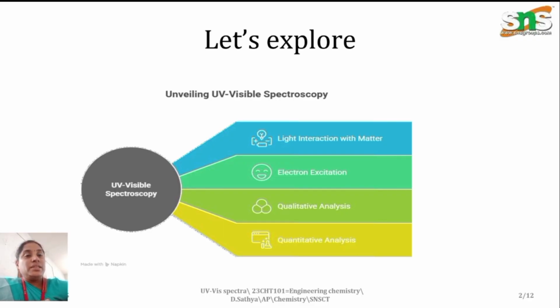In UV visible spectroscopy, the light will interact with the solution and also the electrons. When light enters into the solution, the electrons will move from the ground state to the excited state. The third point is qualitative analysis. This is one of the qualitative analyses and also the quantitative analysis.